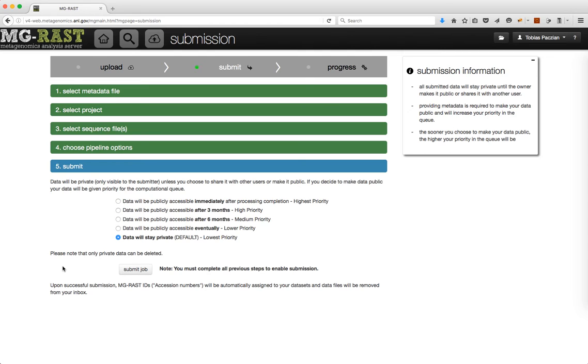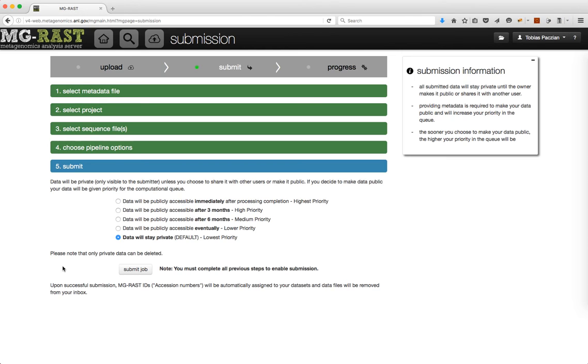Select if and when you want to make your project public and click Submit. Please note that not making your data publicly available will significantly lower your priority in the queue.